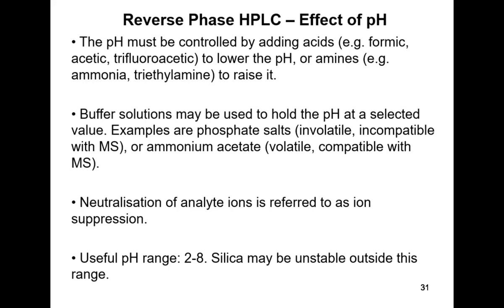So you do need to think carefully, though, about the extremes of pH values, because we're working with silica, which is fundamentally a water-soluble material, and although it's protected to a significant extent by the bonded phase layer, water can still get through to the silica surface a little bit.